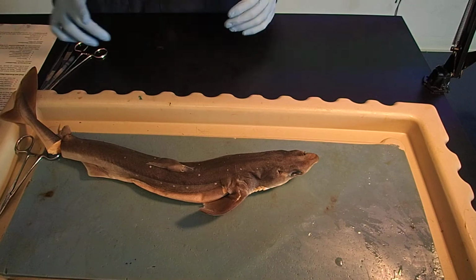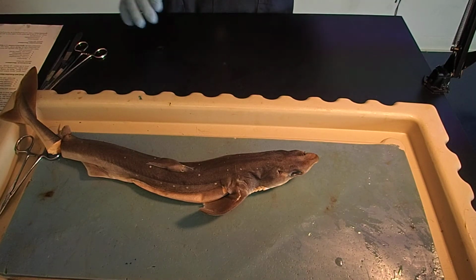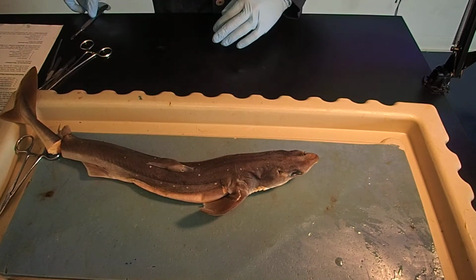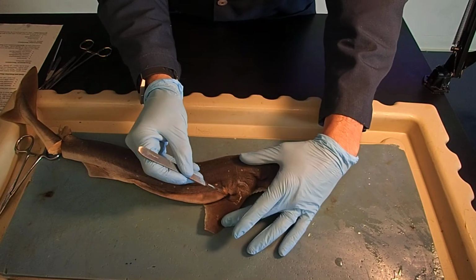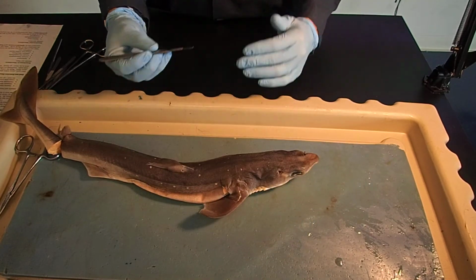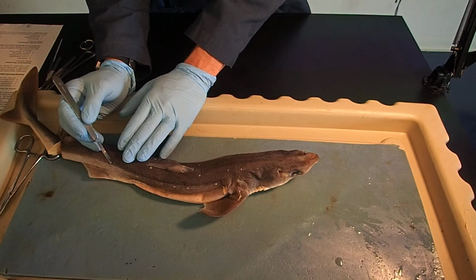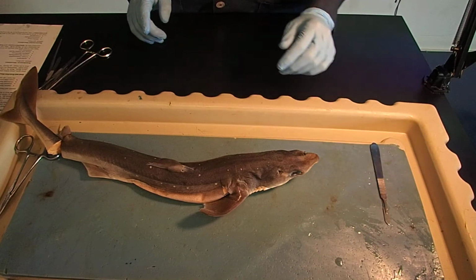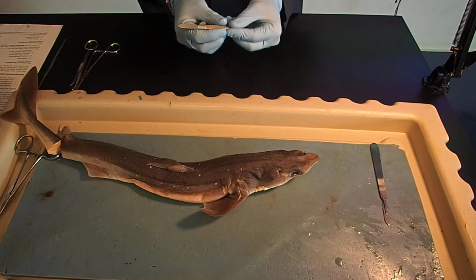All right, so now we are going to start looking at some of the muscles, and in particular, we're going to look at the trunk muscles. So what I've done is I've used my scalpel to carefully make an incision along the side here of our shark. Normally we would do this down here so that we could see just the hypaxial and epaxial muscles. I did it up here so that we could also see some of the pectoral abductors and adductors, which I'm going to show you now.